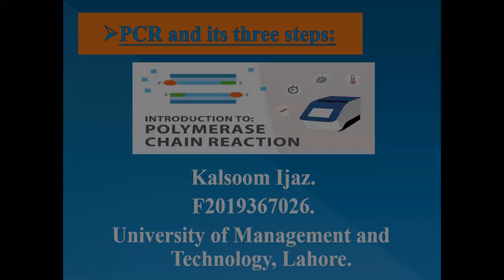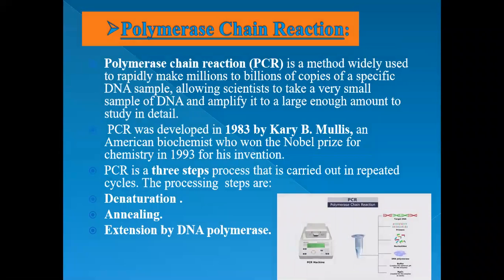First of all, PCR stands for polymerase chain reaction. In simple words, polymerase chain reaction is a technique that is used to make several copies of a small fragment of DNA. If you understand the meaning of the words in polymerase chain reaction, we can better tell about this process from its name itself.